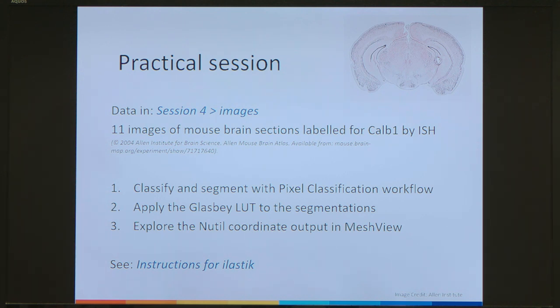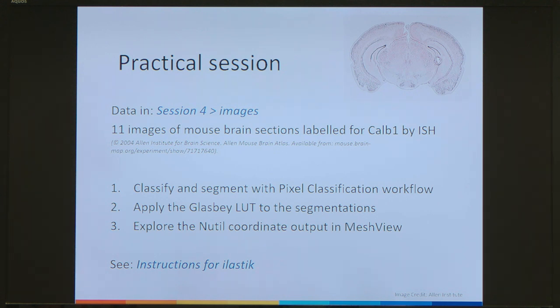The practical session is similar to the QuickNII one in that you have access to some images in the session 4 folder. We're going to classify and extract segmentations with the pixel classification workflow. One thing to note about ilastik is that when you export segmentations, the images are always black by default — this is because a black colour has been applied to all classes by default. Even though it has been classified, it doesn't look like it has been, which is why we have to apply the Glasbey lookup table to apply different colours to the different classes.